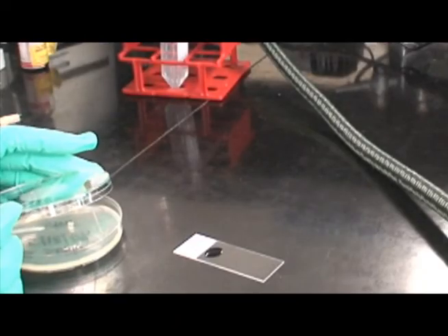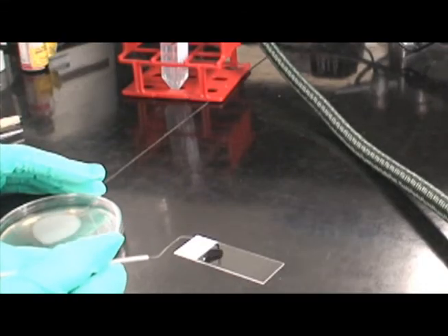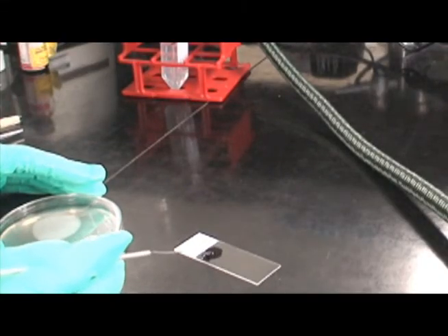With a sterile wire inoculating loop, transfer a small amount of bacteria to the microscope slide and mix with the drop of nigrosine.